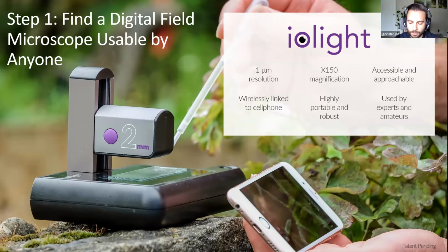And they're highly portable and robust because you can stick it in the pocket of your cargo pants or into a backpack. And you can take them to the field with you, and they hold up to abuse relatively well. And like I said, because they're linked to your cell phone, they also enable you to use other features like, hey, I'm going to take a picture on my cell phone, and that photo is saved into my albums and backed up automatically into my online storage. It also allows you to share stuff through your cell phone via text messages, emails, and links, and so forth. Basically, anything your phone can do with a regular picture, it can now do with a microscopic picture.